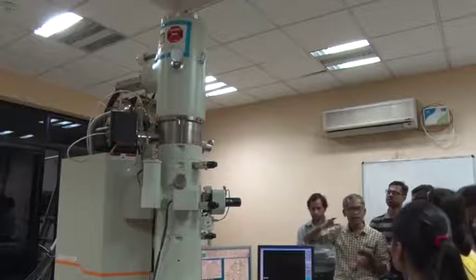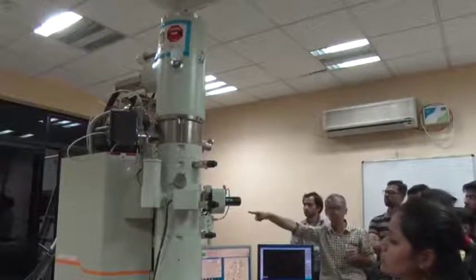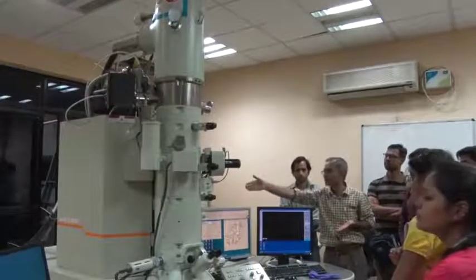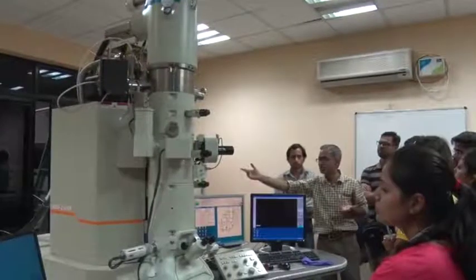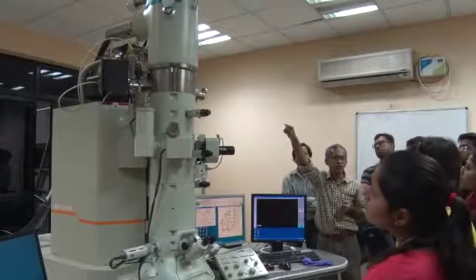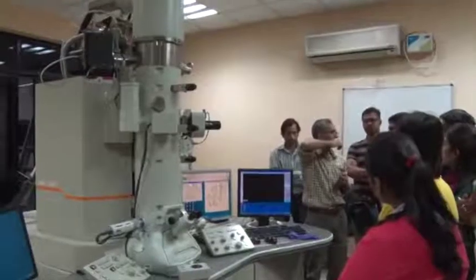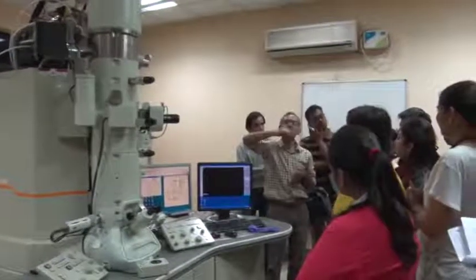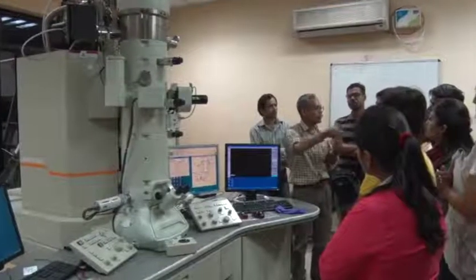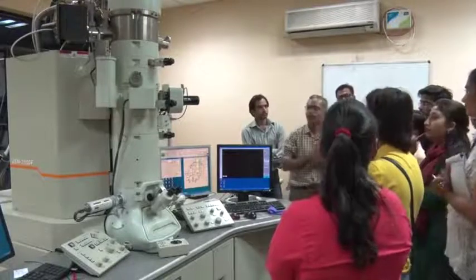200 kV. The voltage that is 200 kV is generated in that tank which is in the corner, and that is basically an accelerator, or high voltage generator, whichever way you call it. This voltage is then given to the gun. So first we start at a very low voltage. When you are starting it for the first time, you raise the voltage gradually. That is true, yes, conditioning, as they call it.